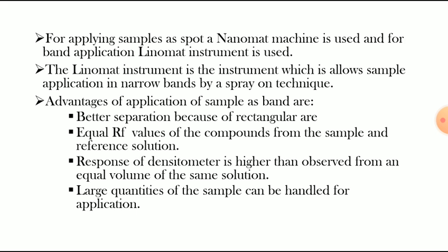And last one, large quantities of the sample can be handled for application. See, that means in the first advantage, the separation will be very nice because of the rectangular area, and we will get equal RF values, that means standard and sample we can compare, since we will get the equal RF values of the compounds.